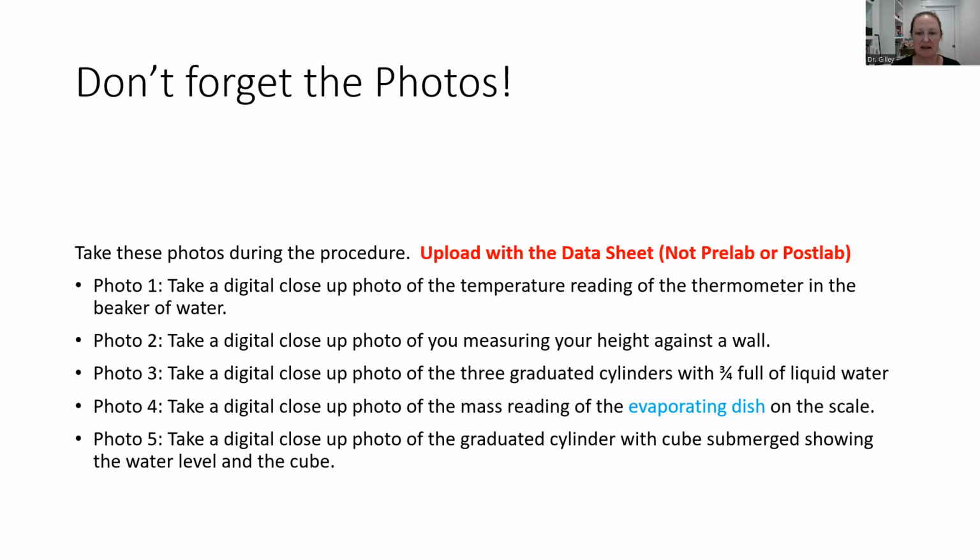And then in the lab manual, I think it still says your cube. But we could go ahead and replace that with the evaporating dish. There were a little bit of changes, and not every single place where the word came up did we actually manage to change it. So just change that in your lab manual to say the evaporating dish instead of the cube.